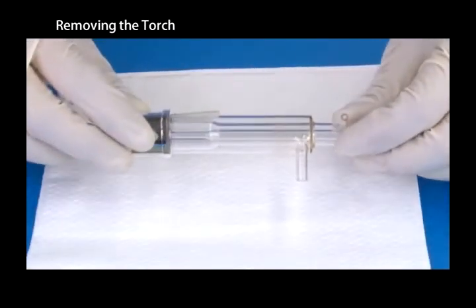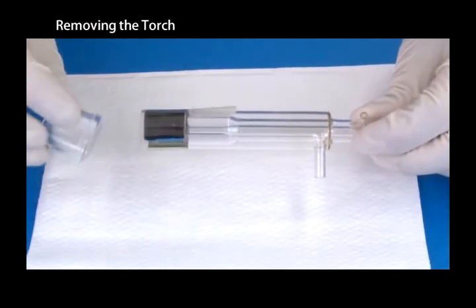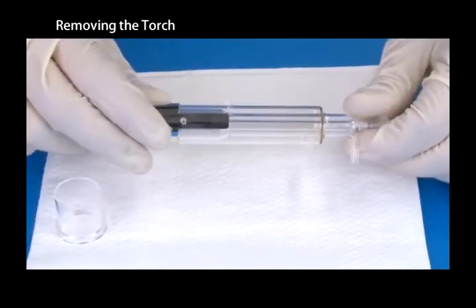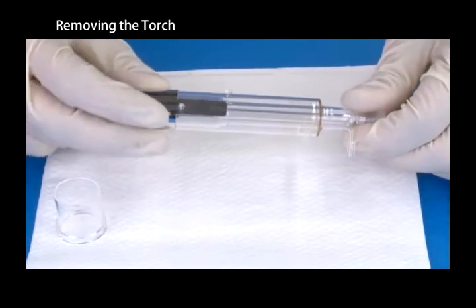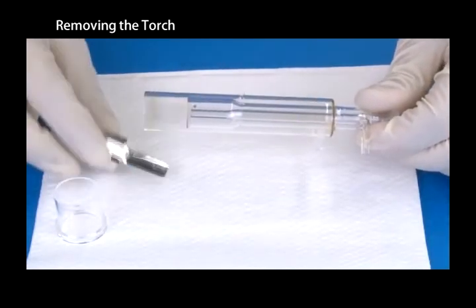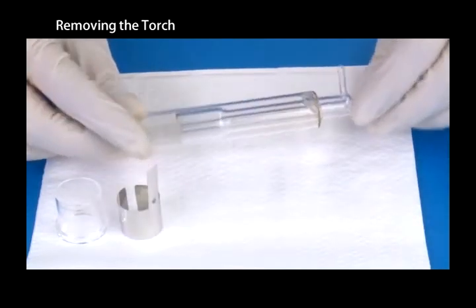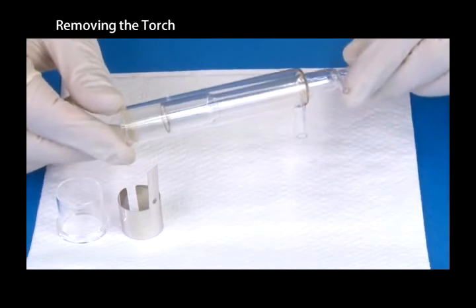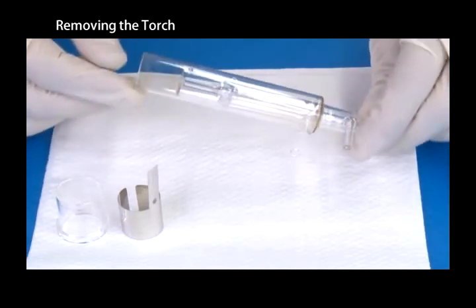Remove the bonnet and shield plate from the torch. Check the torch, bonnet and shield plate for imperfections after removal.